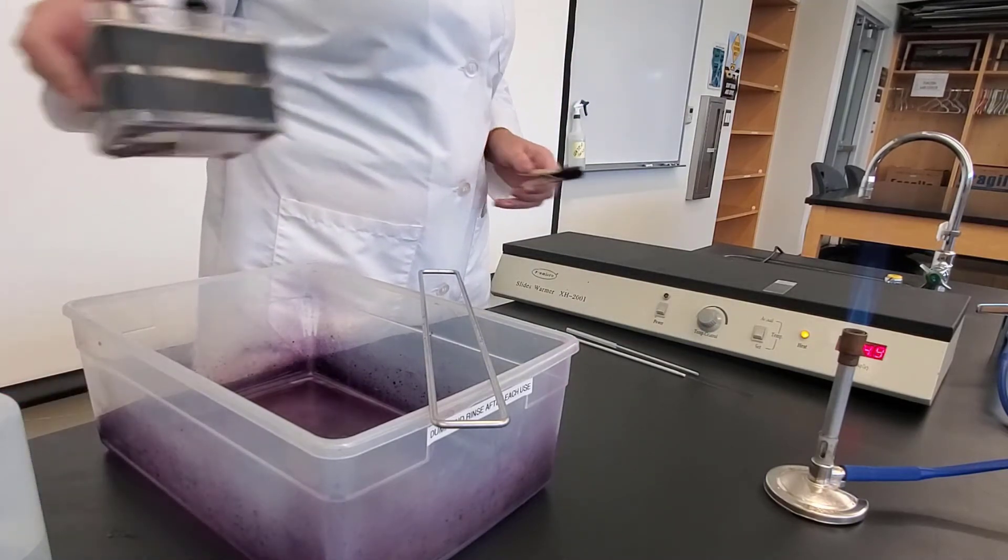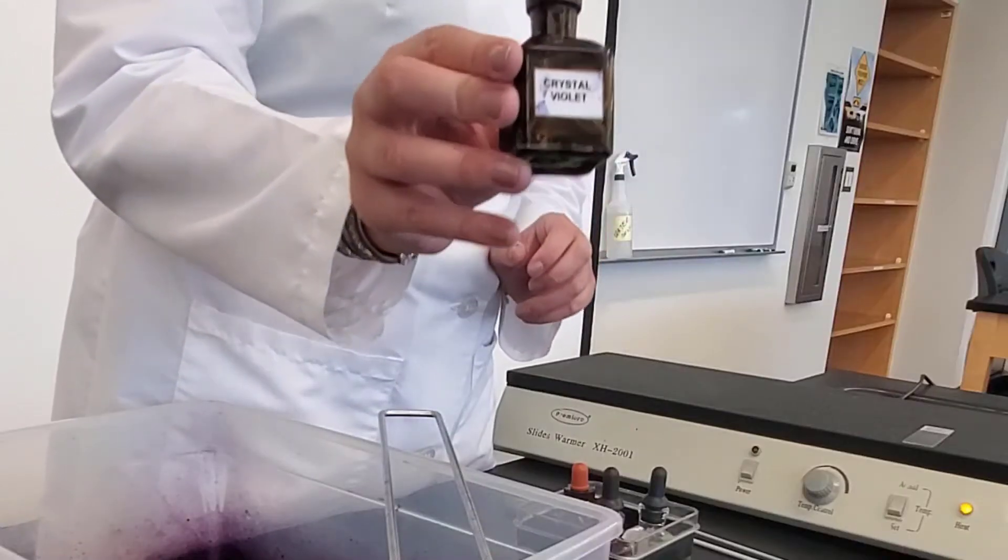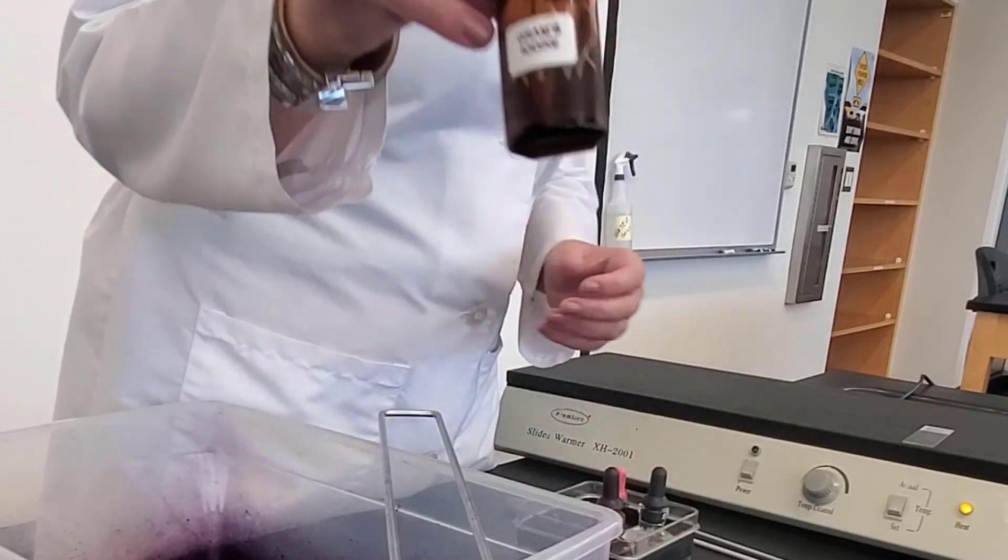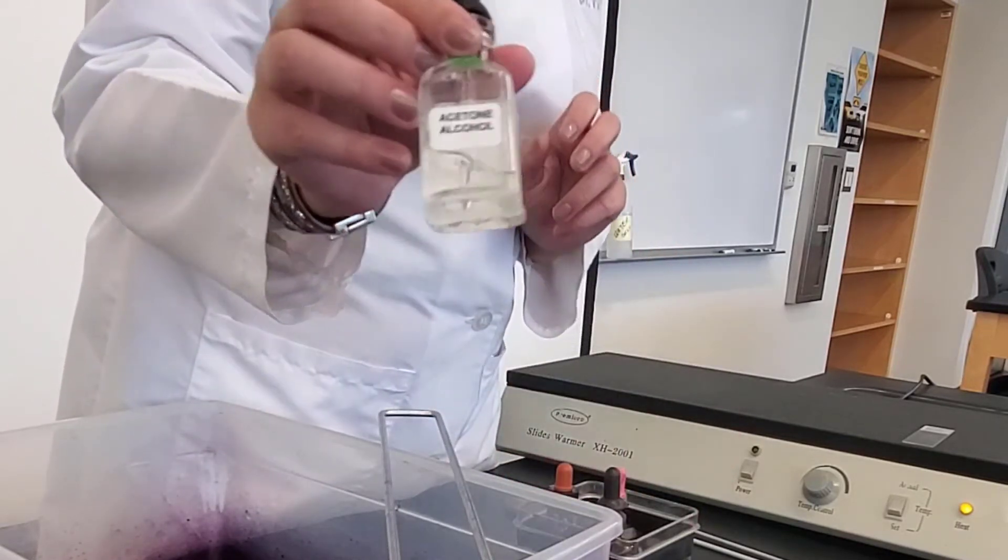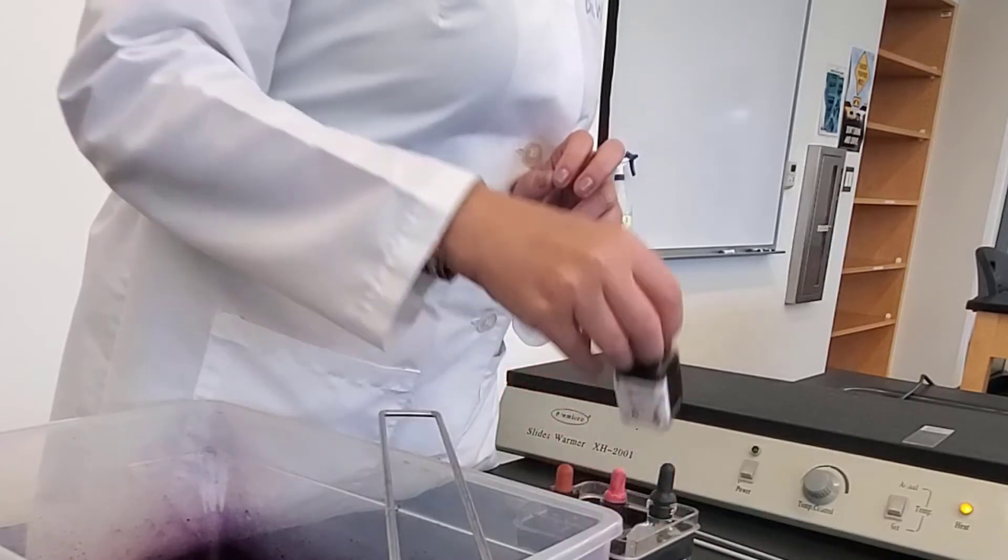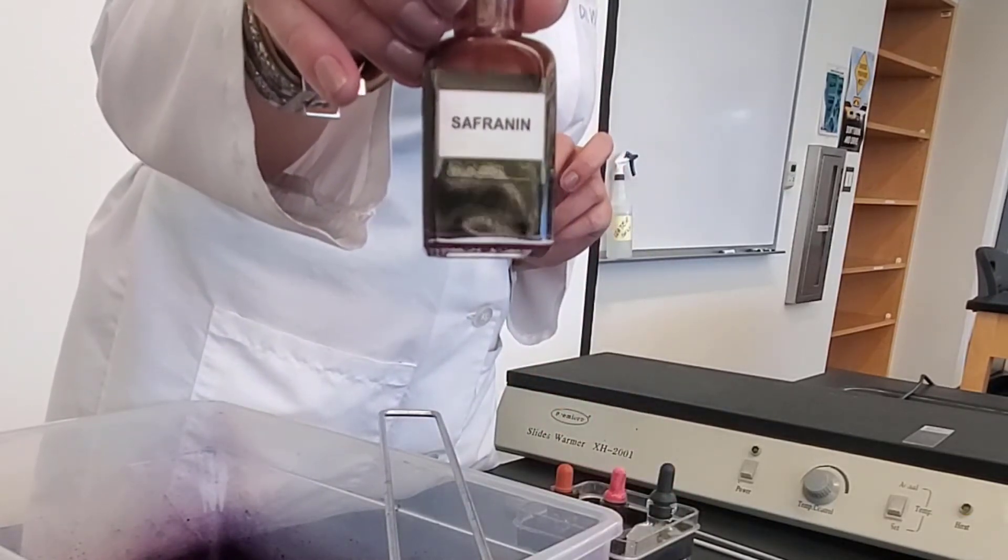And while I'm letting that dry, I'm going to grab my Gram Stain Kit. In my Gram Stain Kit, I have my Crystal Violet. I have my Iodine. This is my Mordant. I have my Decolorizer, my Acetone Alcohol. And I have my Safranin, which is my Secondary Stain or Counter Stain.